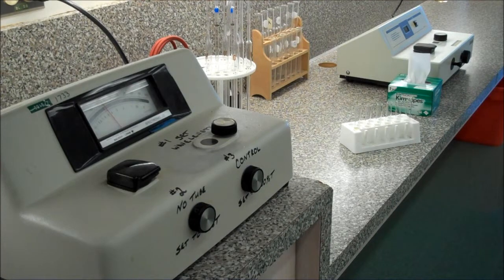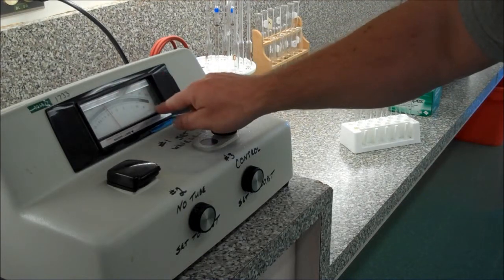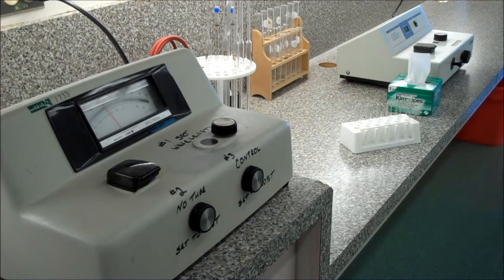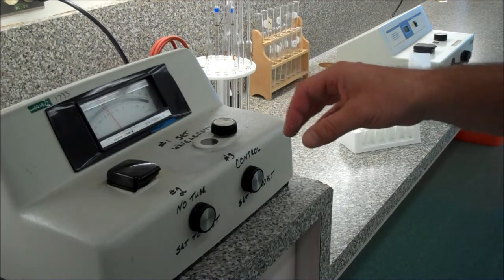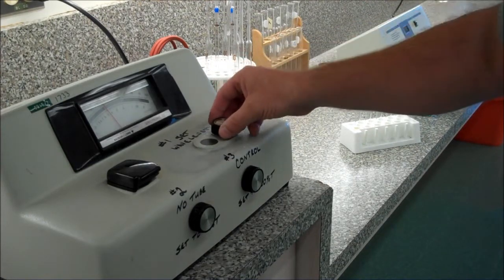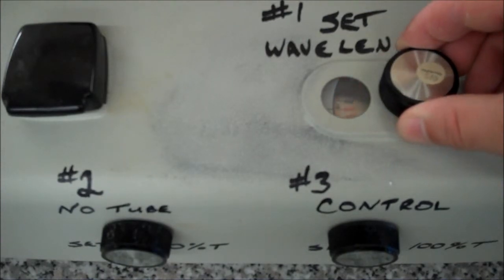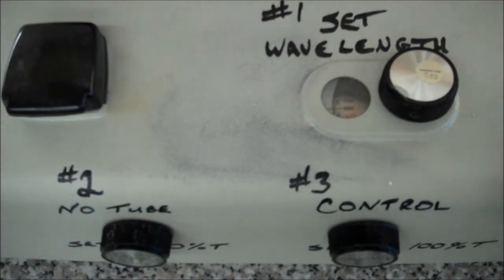Spectrophotometers come in two main varieties. Analog varieties — that's what this one is — meaning there's a sort of a dial in the background. There are two scales on the dial: one's for absorbance, and the top one is for percent transmittance. Effectively, what's in there is a light source, and hooked to this dial there's a diffraction grating which converts the white light into the rainbow. So we change the dial to set the wavelength — we'll set it to 590 nanometers. The wavelength of light corresponds to its color, and certain reagents will absorb specific colors more than others, so you want the machine to be as sensitive as possible to the color absorbed to the greatest extent.